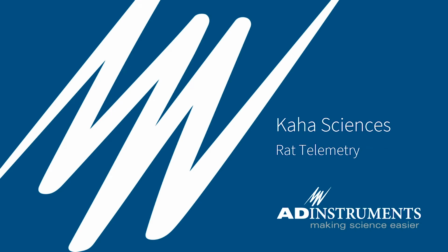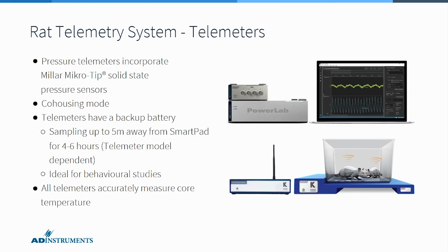So I'm going to move on now to talk more specifically about the rat telemetry system. The rat telemeters and the rat telemetry system offer the ability to measure physiological pressure, and that's achieved by the incorporation of the Millar Mikro-Tip pressure sensors.